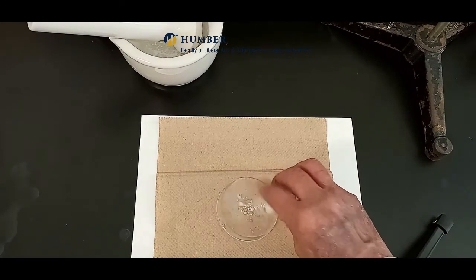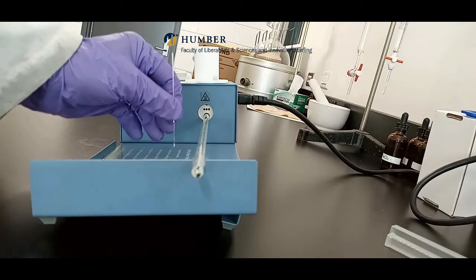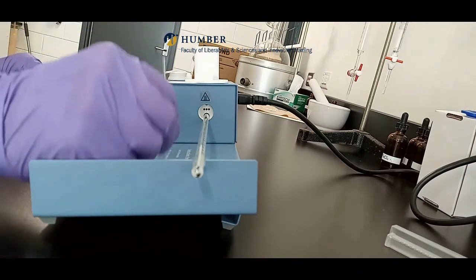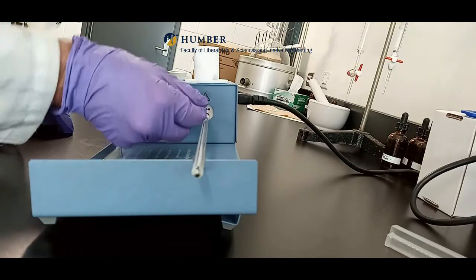Place a small amount of the sample in the open portion of the capillary tube. Gently tap so that the sample falls to the bottom of the capillary tube, which is sealed. Place the sample into one of the slots.